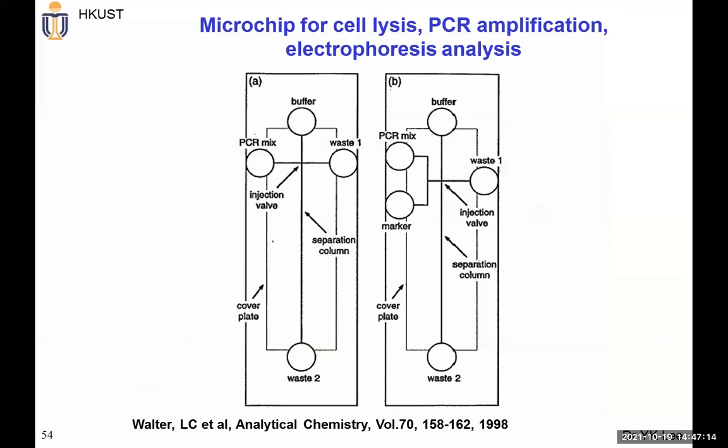Of course, as I mentioned last time, we have a goal for this kind of microfluidic device, microfluidic system, or lab on chip. What do we want? What do we want for this microfluidic device system? We hope, as a user, we can really quickly do this kind of microfluidic process, maybe for COVID-19 testing.